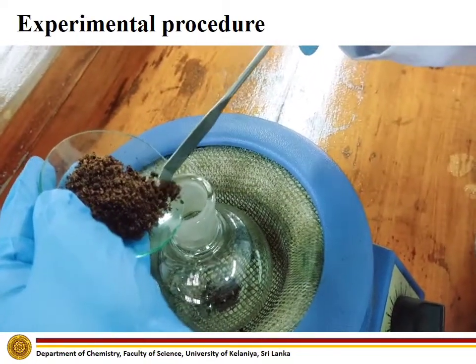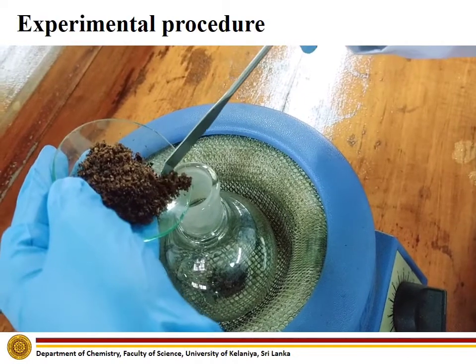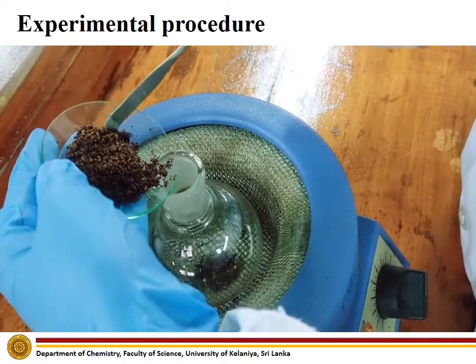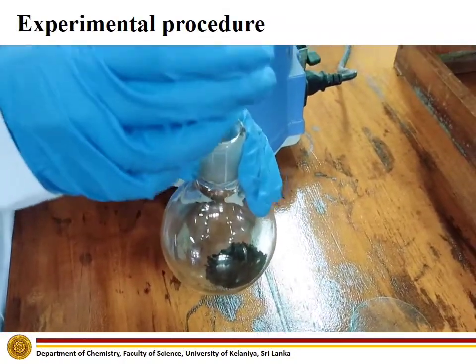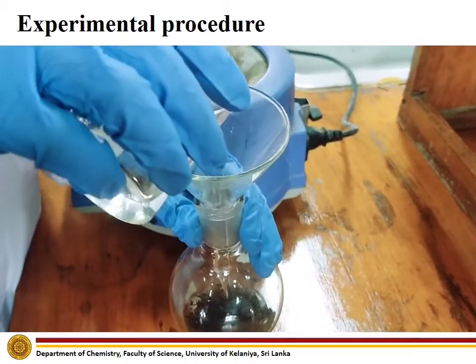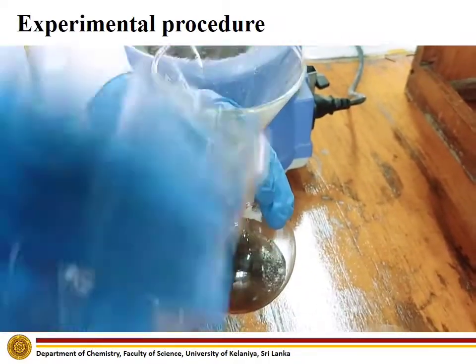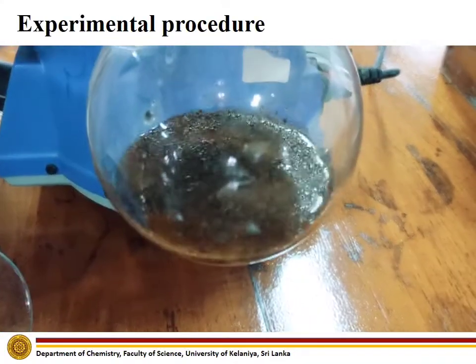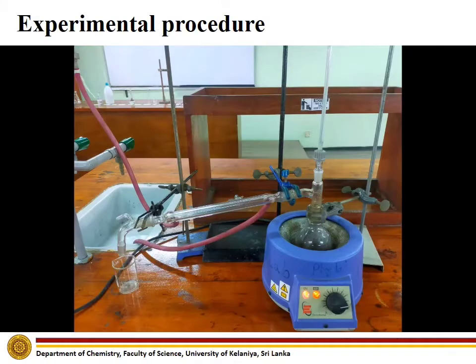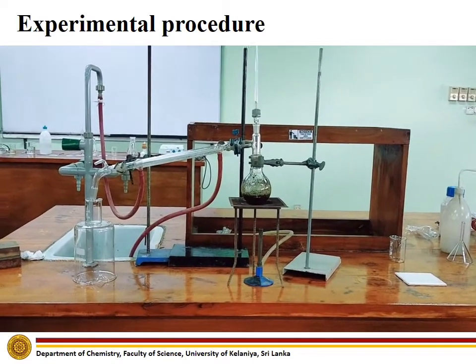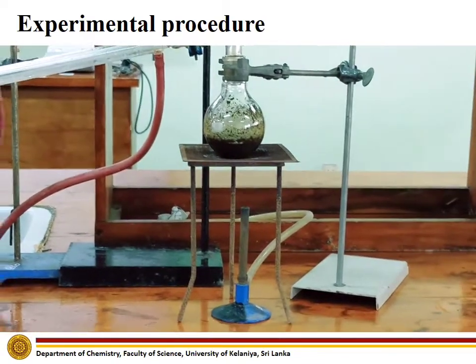Transfer about 5 grams of ground clove into the round bottom flask. Next, add 50 ml of distilled water into the round bottom flask containing the sample. Place the round bottom flask within the heating mantle and set up the distillation apparatus as shown in this figure. A beaker is kept at the receiving end of the setup. If you do not have a heating mantle in your laboratory, you can also use a Bunsen burner in its place.